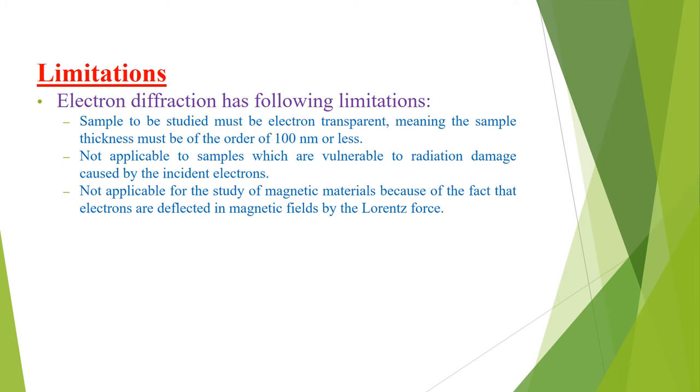This technique is not applicable to samples which are vulnerable to radiation damage caused by the incident electrons. It is also not applicable for the study of magnetic materials because electrons are deflected in a magnetic field by the Lorentz force.